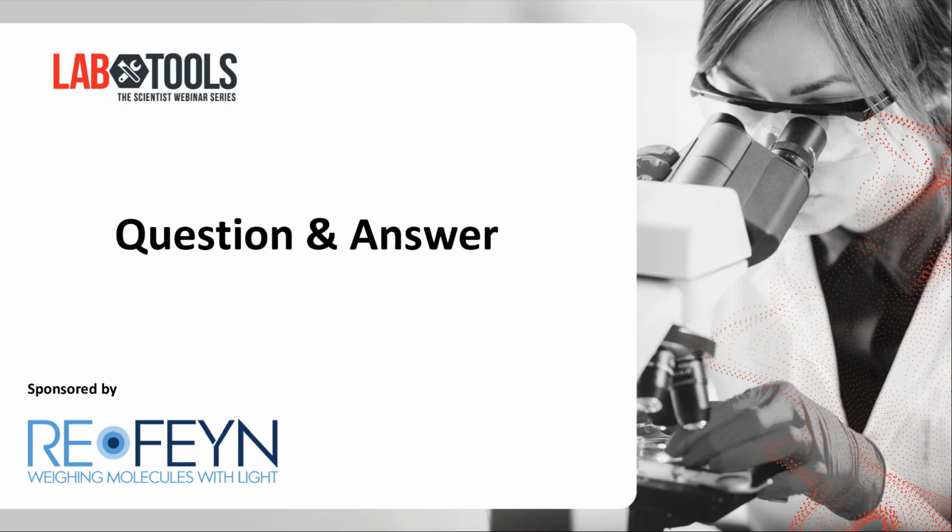Yeah, so should I answer it, or do you want? Yeah, go ahead. So this works like in any other fluorescence-based super resolution technique, that you fit a point spread function to your spot detection. So you get sub-diffraction resolution, but not in Z because it's planar.